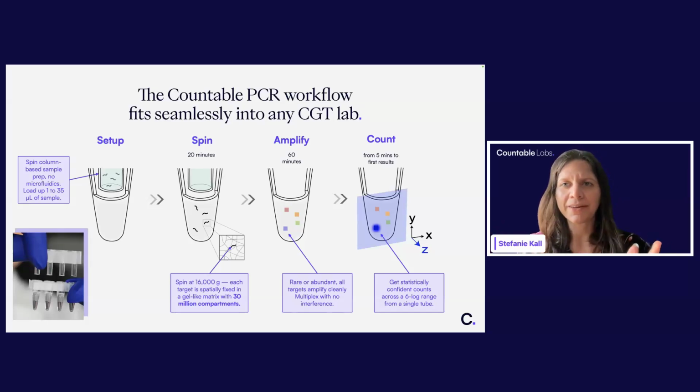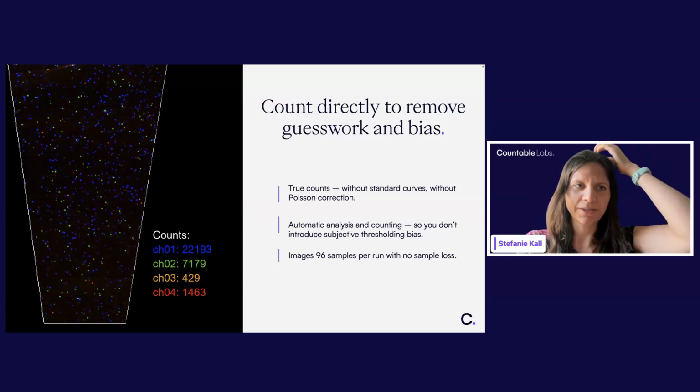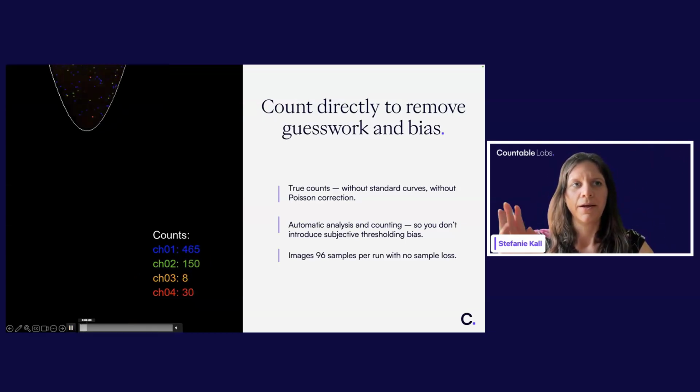And so what does that look like? I have a nice little video that makes it, I think, a little bit clearer. So here again, you're going to have a tube and your light sheet is moving this way. So let's take a look at what that looks like.